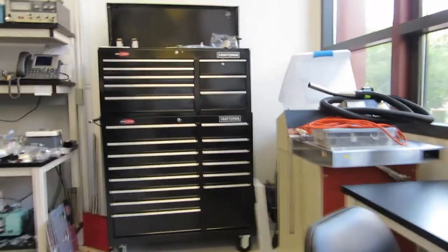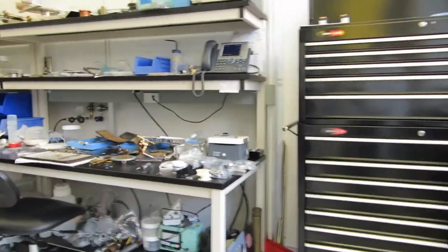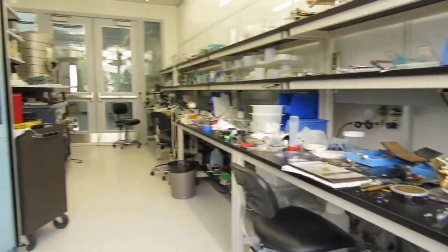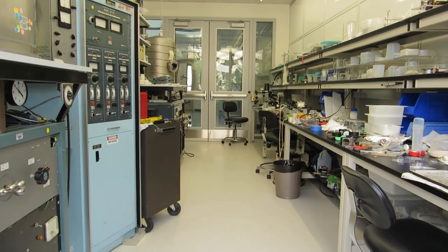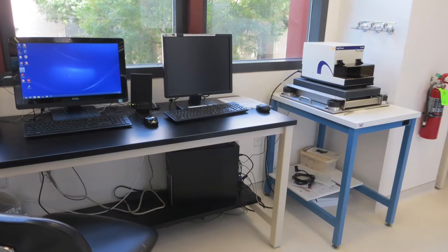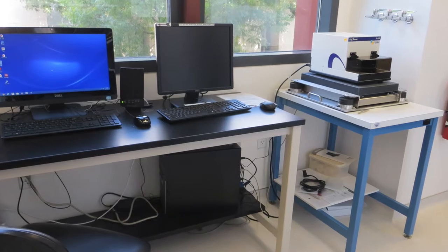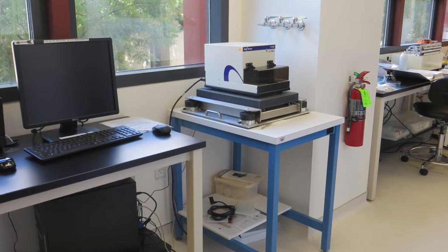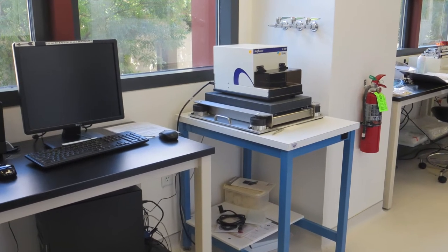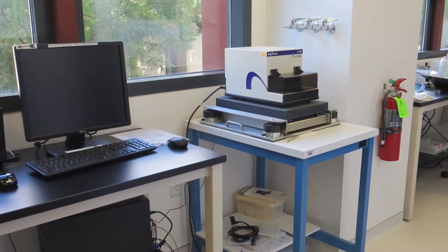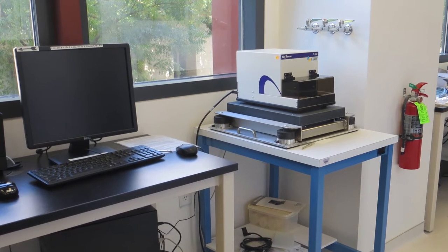This last room is mainly just for use by the lab manager for doing microfab shop work. Please don't touch anything in this room without permission. The profilometer uses a diamond stylus to measure step heights such as measuring the thickness of photoresist or thin films, or for measuring the depth of an etched trench after ion milling or wet etching.